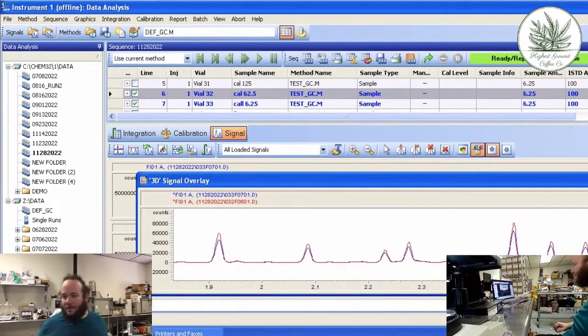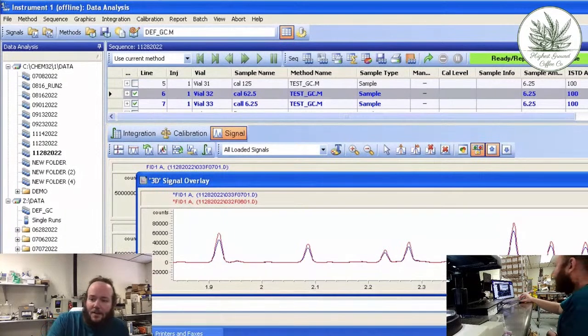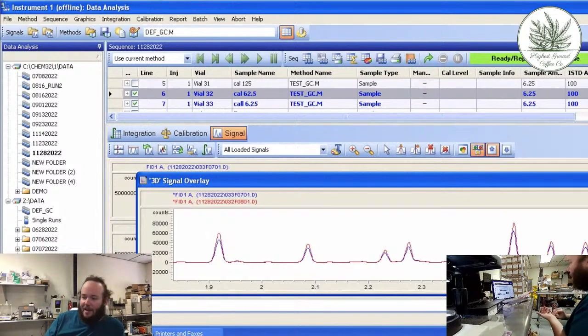All right. Too much in the vial? Yeah, very possibly, Old Scratch. Very possibly too much in that vial. So if there's not enough headspace, then it may not be able to vortex mix. It's hard to say.